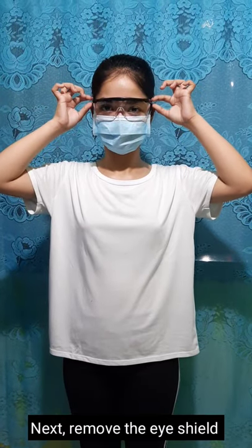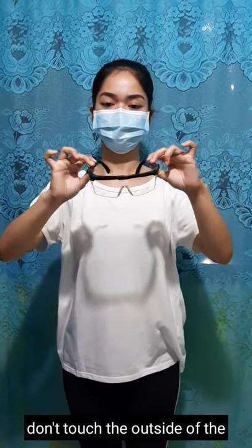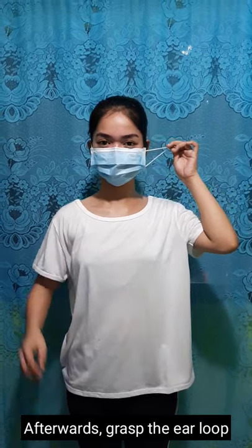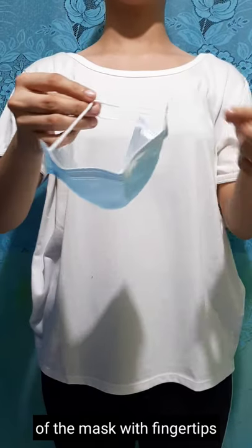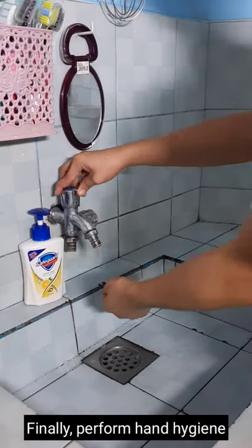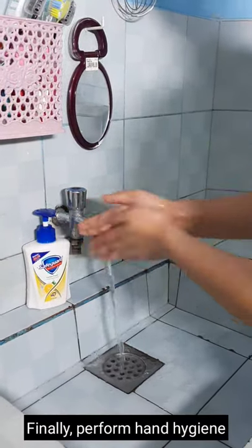Next, remove the eye shield. Don't touch the outside of the eye shield because it is considered contaminated. Afterwards, grasp the ear loops of the mask with your fingertips. Then, discard it in the trash bin. Finally, perform hand hygiene.